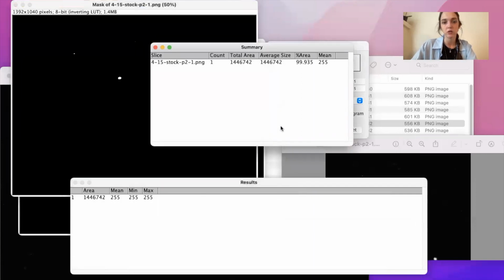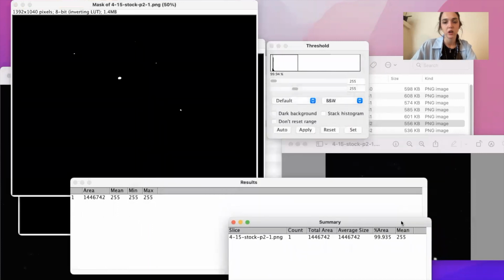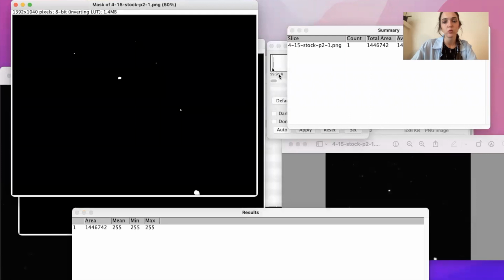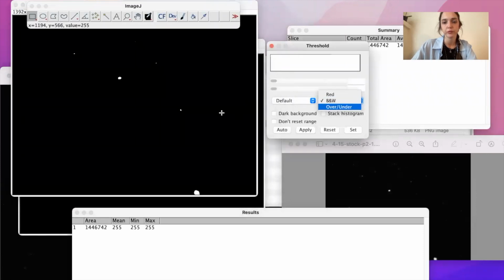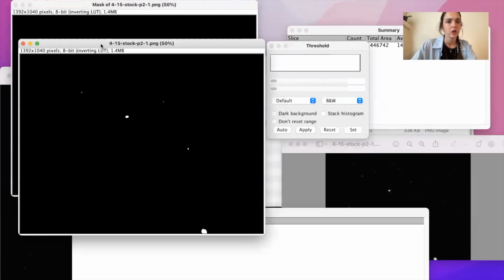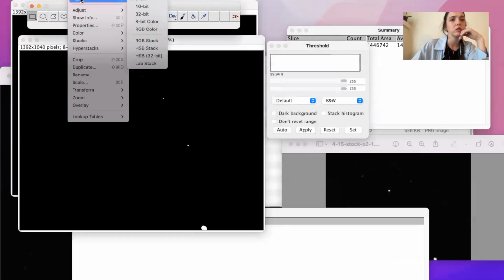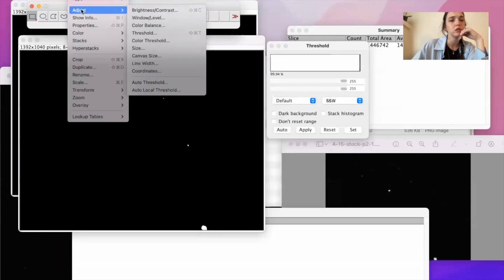Summarize. Okay, that was a total area. Oh, never mind. Oh, I think I should I binarize this?